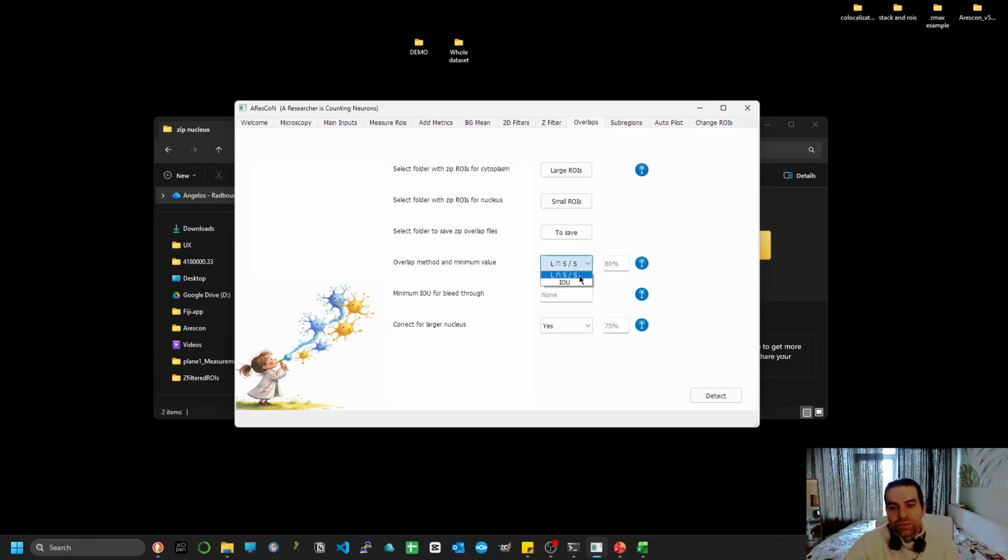You can also go for intersection over union, but I haven't tested that thoroughly, so I'm not even sure if it will work okay, but you're encouraged to do so and let me know, of course. And what percentage? Let's say I want at least 80% of my nuclei to be inside the cell.